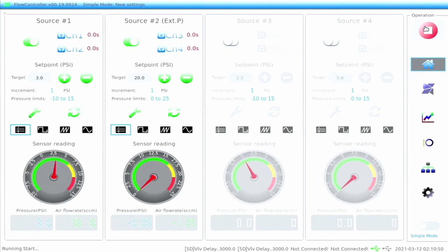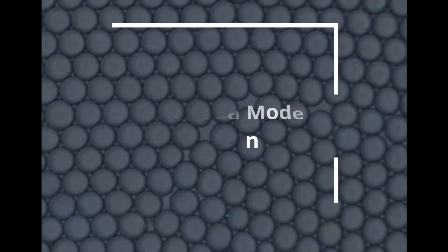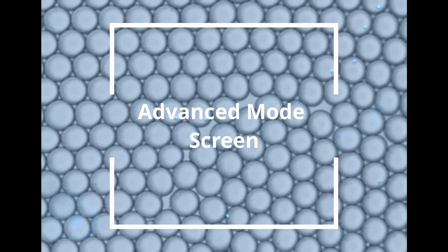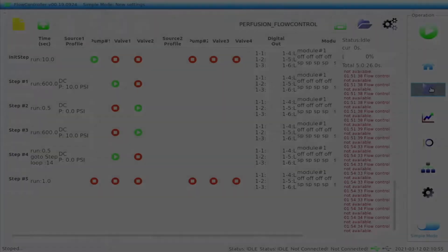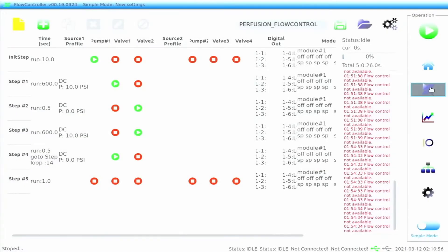Click the blue pinwheel icon in the function zone to access the advanced mode screen. Here, users can write a specific script which can set pressures for different channels and on and off for valves at different time periods.